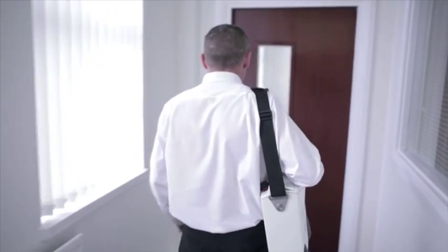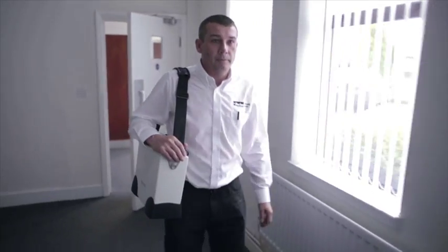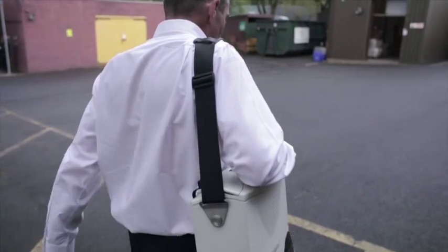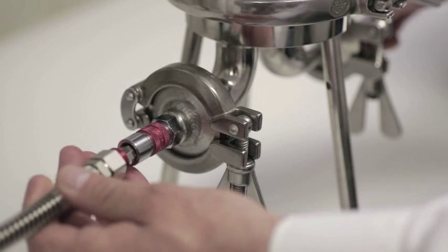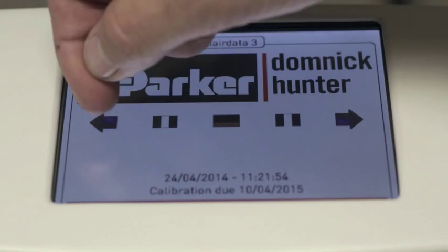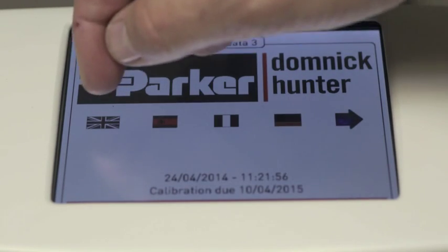The unit is lightweight and portable, allowing for easy transfer to in-situ testing stations within the facility. The unit is easy to use with quick connection to the filter housing and multi-language touch screen operation for test selection.